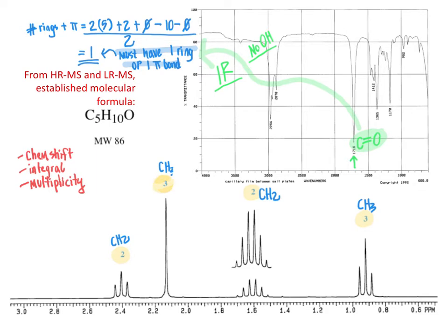And so we have within our NMR data here 2 methyl groups, a methyl group at about 2.1 ppm, here that I'm circling with my laser pointer, another one at about 0.9 ppm that I'm circling now with the laser pointer. And so we can predict that those are going to be the end points for the molecule. So what I am going to do is pick one of those two methyl groups at random and start working inward from there to try to piece together the structure of this molecule.